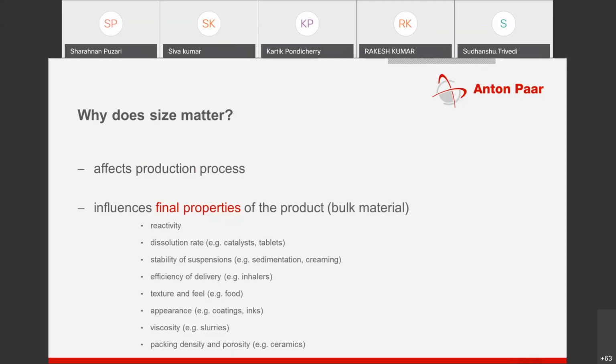You can use particle size as well as a rheometer for viscosity. Then packing density and porosity, for example, in ceramics.